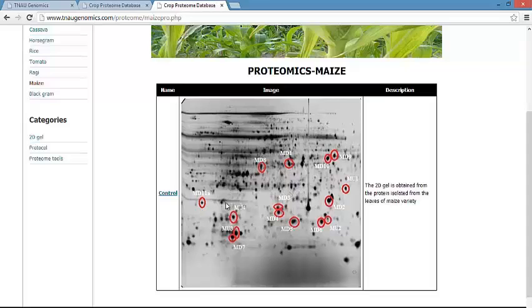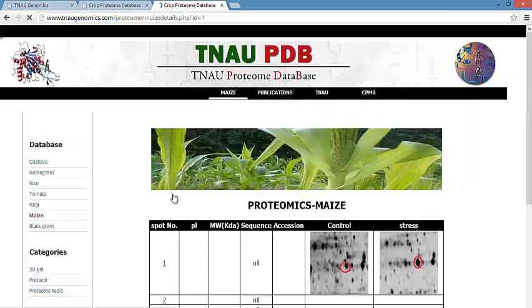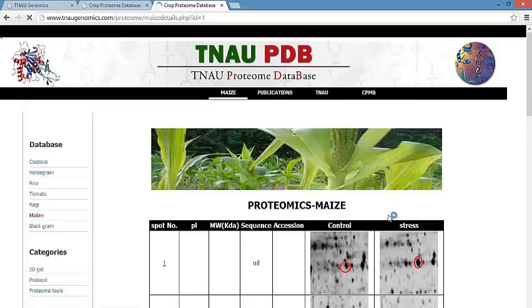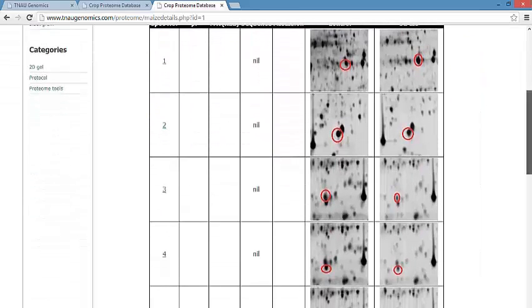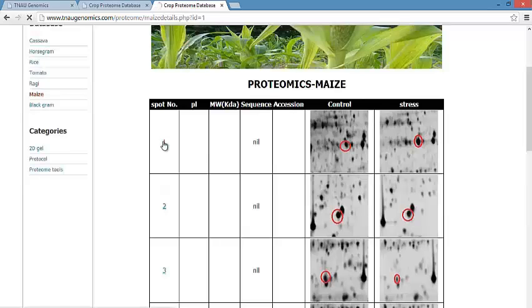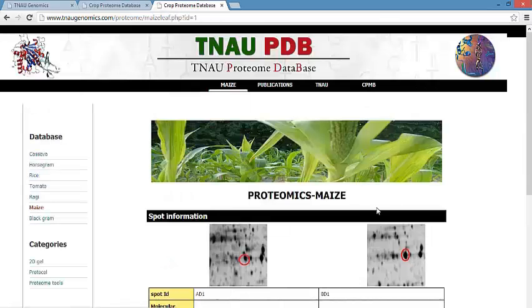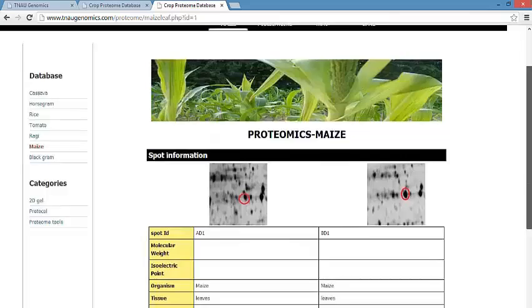The gel image contains spots of upregulated and downregulated proteins. There are totally several downregulated and upregulated spots present. Each spot can be clearly studied, and by clicking the spot ID we can get further information about the spot.